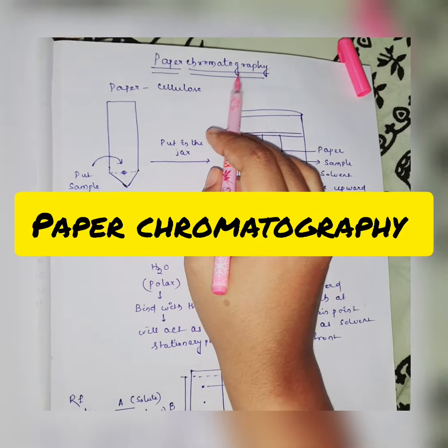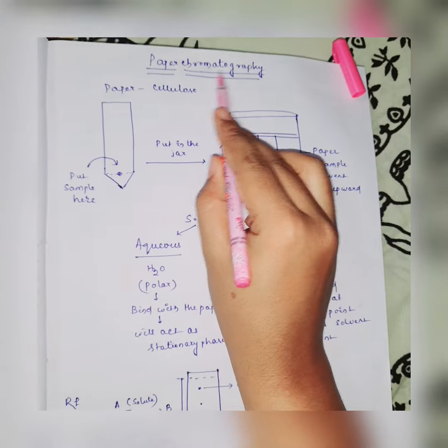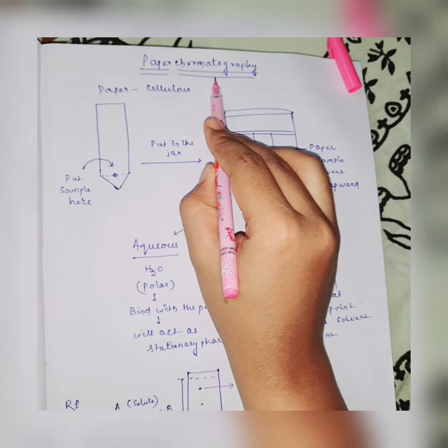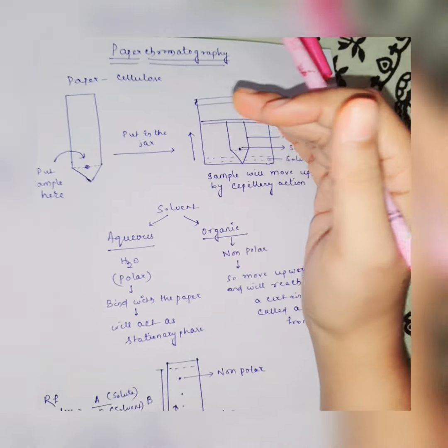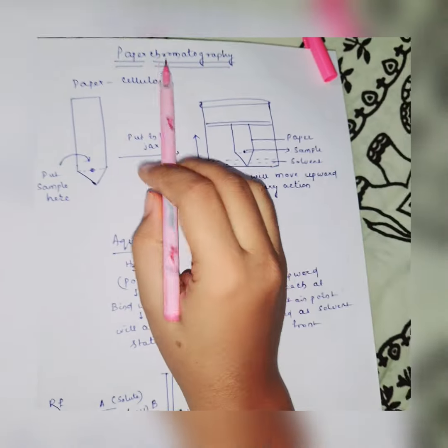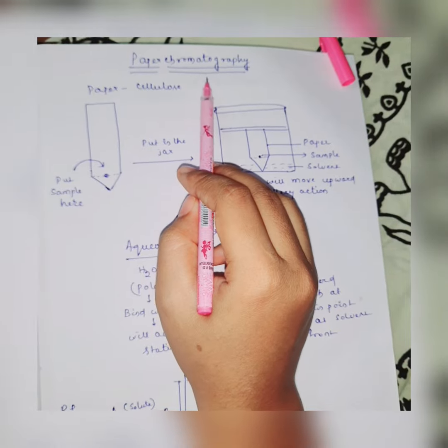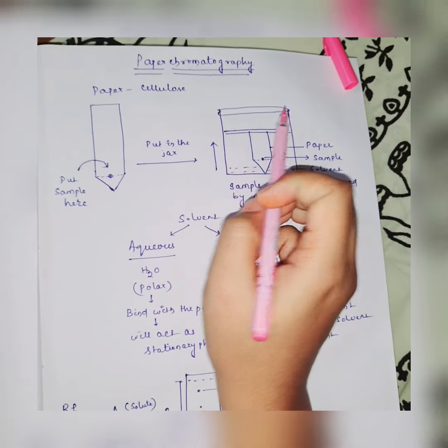Do you know what is the meaning of paper chromatography? At first, chromatography means a technique used to separate different components of a mixture. By using the chromatography method, we can separate different components of a mixture.